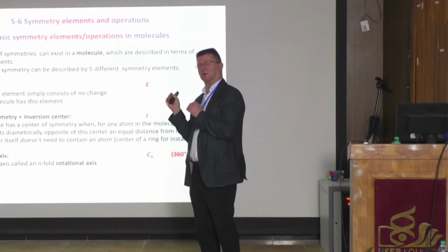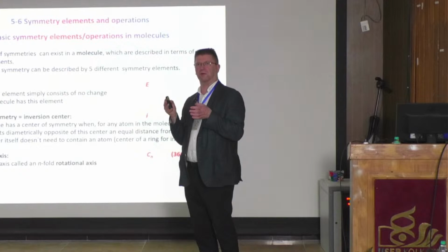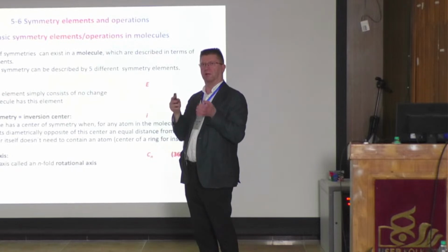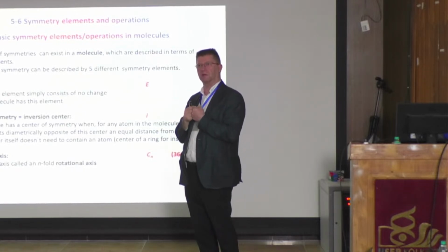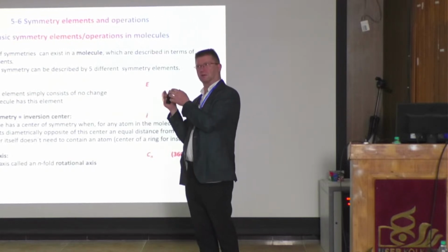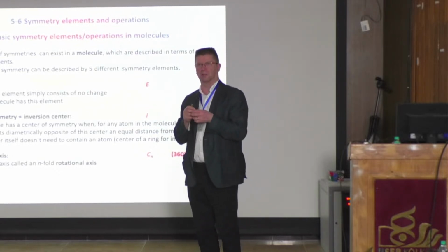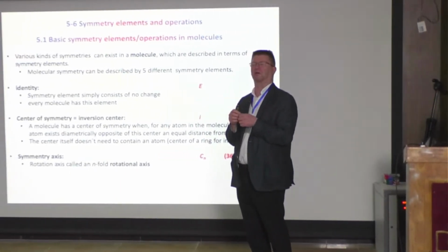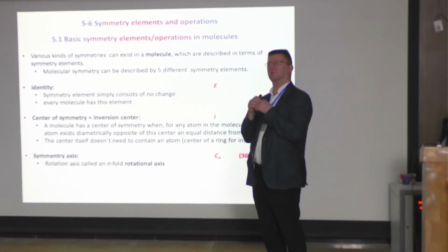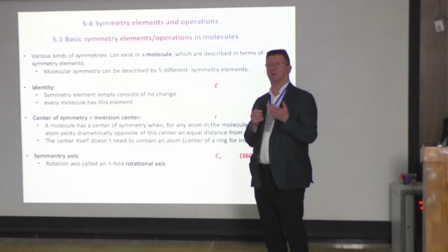diffraction comes from there. This is an interesting thing, that the idea we start like climbing to the tree from the top. We are discussing something purely theoretically, but actually all this information is in the data what we get from when we do the measurement. So we use the data to extract all this information. And that's why it's very important when we always say that we have to have a good single crystal, because if we don't have a good single crystal, we have a bad data, and then we can't get this information. So that is different from the mass spec or NMR, where you can run the experiment.